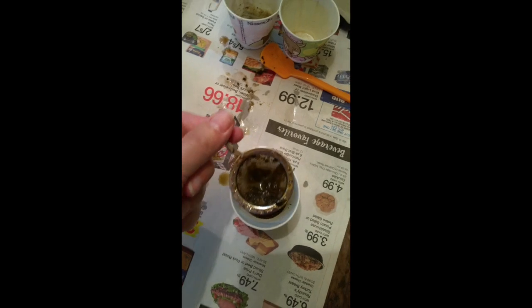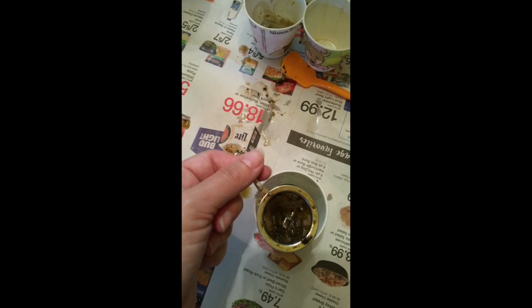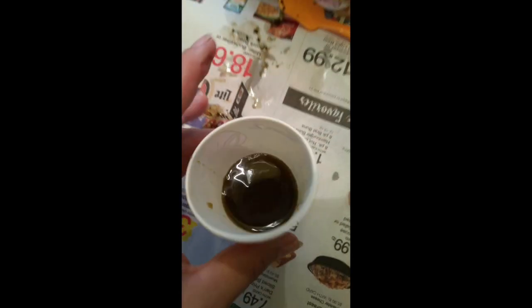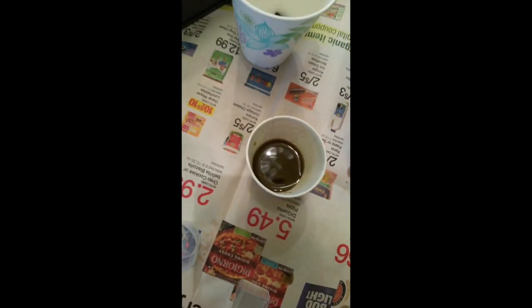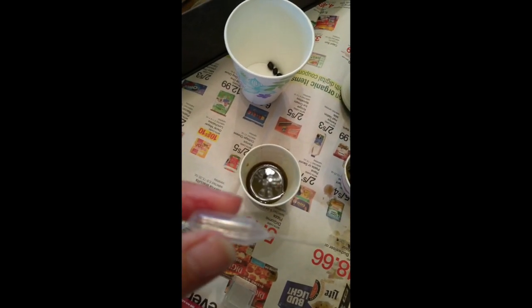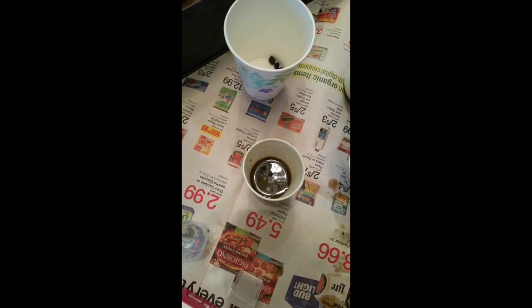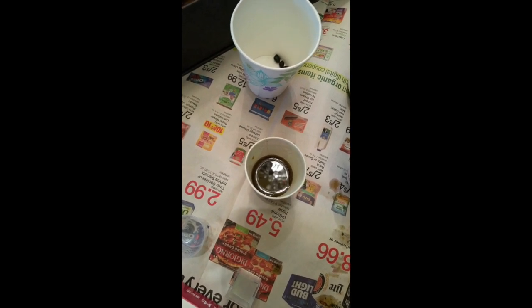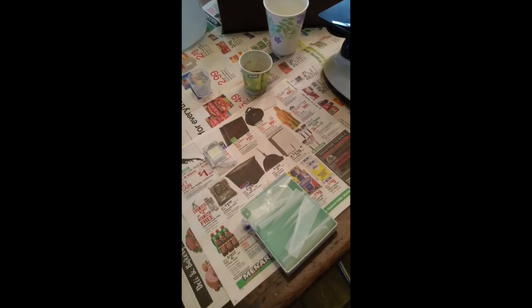I'm straining out all the barnyard stuff - the grains and hay they eat. You can see there's a little left over, but what I'm left with looks like really dark roast coffee. I'm going to let this sit for five minutes. The fecal solution will let all the eggs rise to the top, where I'll take my tiny pipette and suck a little from the top of our 'coffee.'